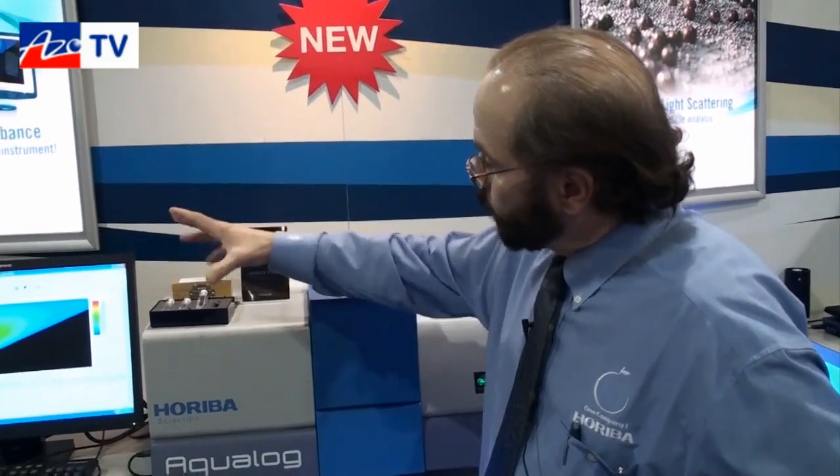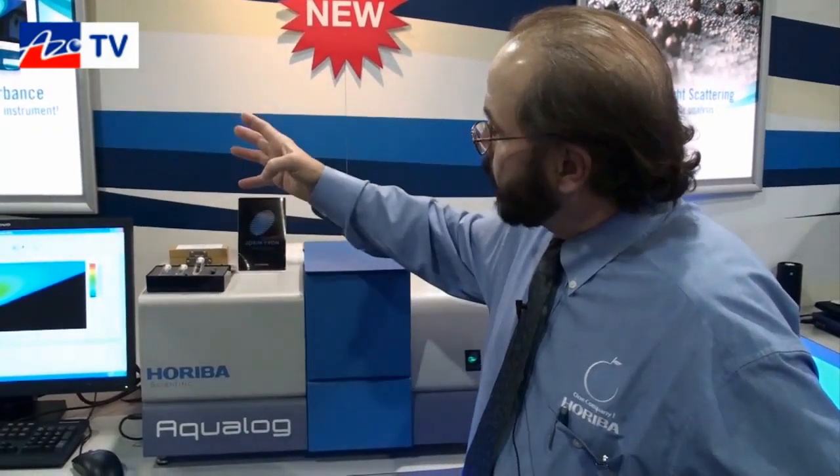Adam, just before we finish up, what are typical applications for the Aqualog? You were saying before that it gets used for water analysis. What other things do you use it for? Well, primarily it's for analyzing dissolved organic matter. The compound is known as CDOM. This is almost anything that's dissolved in water.